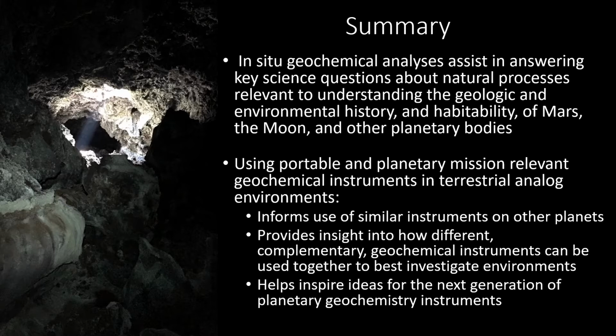So in summary, these discussions of examples of studies utilizing handheld LIBS and XRF analyses enable us to consider several takeaways about the uses of in-field geochemical analyses. In situ geochemical analyses assist in answering key science questions about natural processes relevant to understanding environmental and geologic history and habitability of the Moon, Mars, and other planetary bodies.